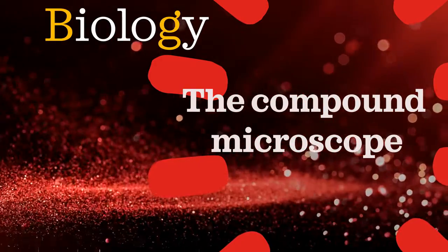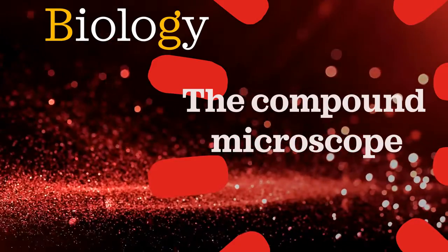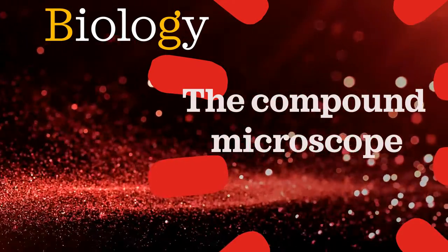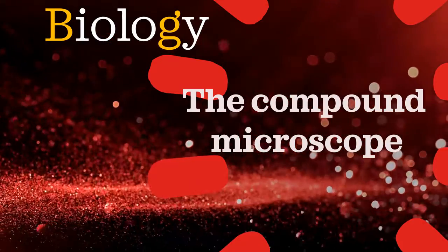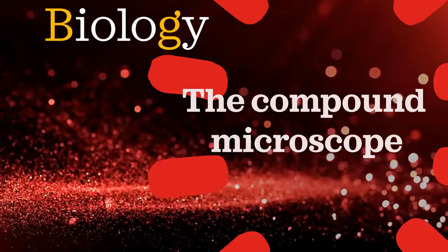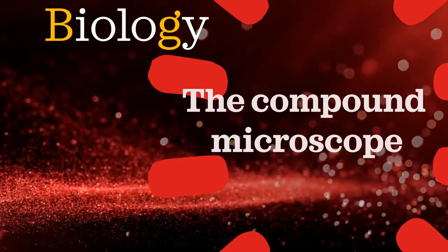Hello, I'm Jana Ahmed Abdul Sadiq and today we will talk about the compound microscope. Let us learn about the parts of the compound microscope and how we can use it.